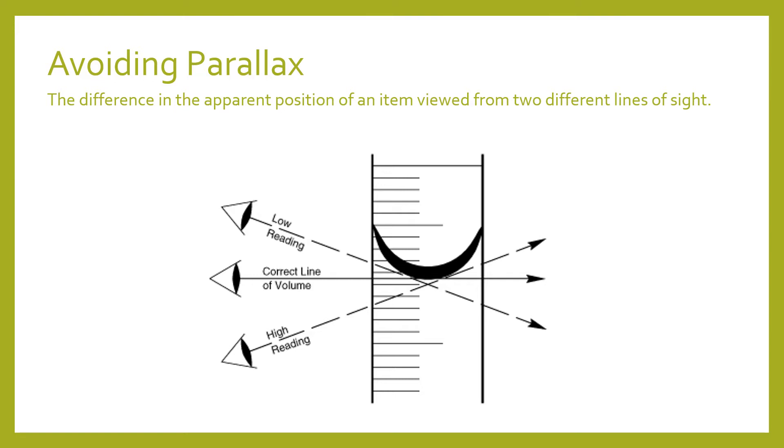When we're reading liquid levels in glassware we want to avoid parallax, which means reading the wrong volume because our line of sight was not directly in line with the bottom of the meniscus. The meniscus is that U-shape that forms when water sticks to the sides of the glass, and we always want to read at the bottom of it — your eye should be in line with the bottom of the meniscus to read the most accurate volume.